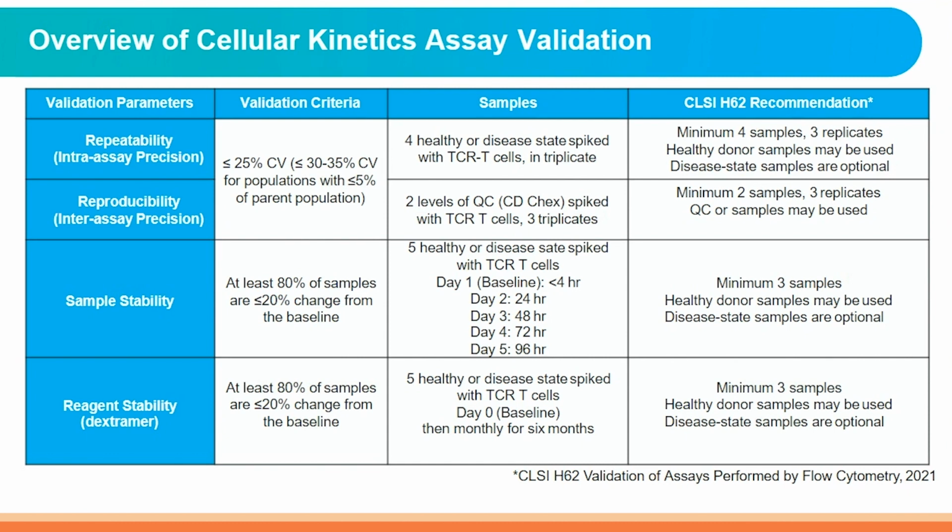Sample stability is very important for flow cytometry assays, especially when whole blood is used. We normally start to evaluate sample stability in the method development stage, looking at types of anticoagulants, types of collection tubes, and storage temperature by checking the frequency of cells and memory markers.